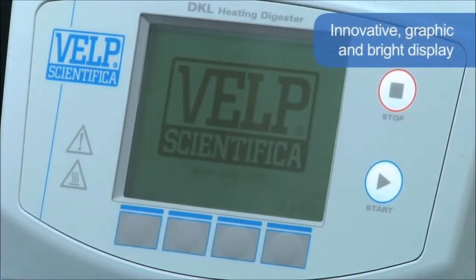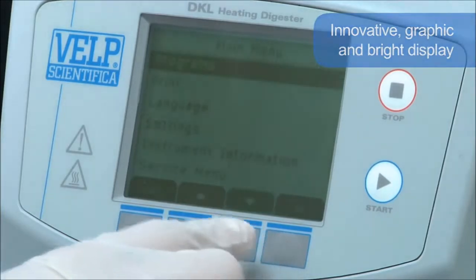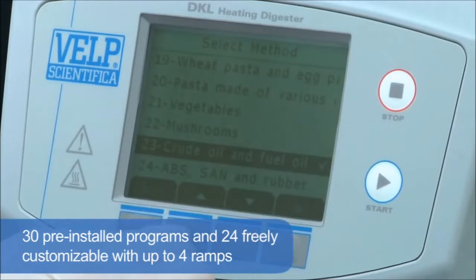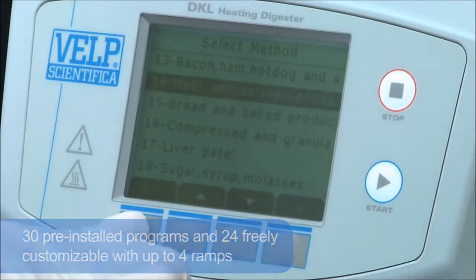An innovative graphic and bright display guides the user in a simple and fast way, planning and monitoring the various digestion phases. A 30-program library is pre-installed according to the most common applications. 24 programs can be freely customized with up to 4 ramps for digestion of particular samples.